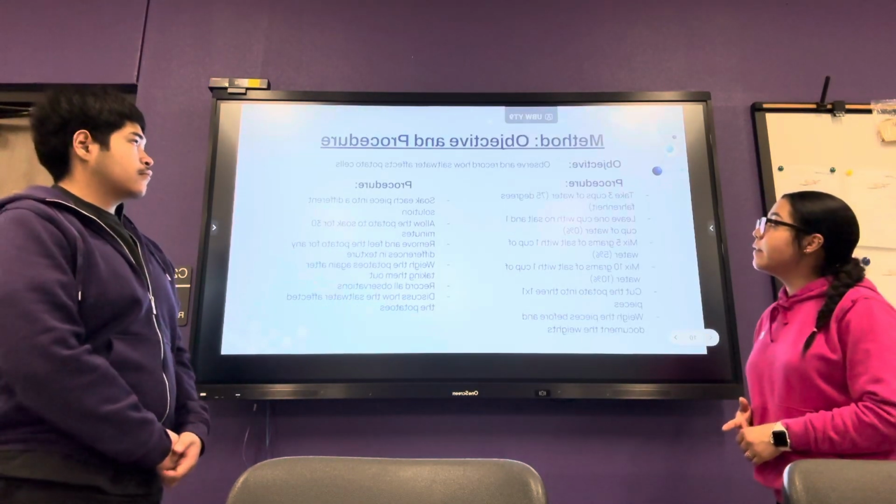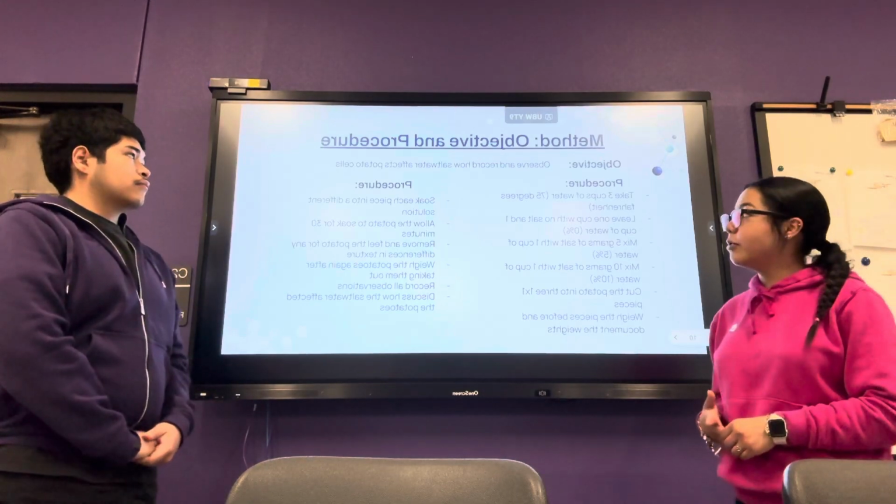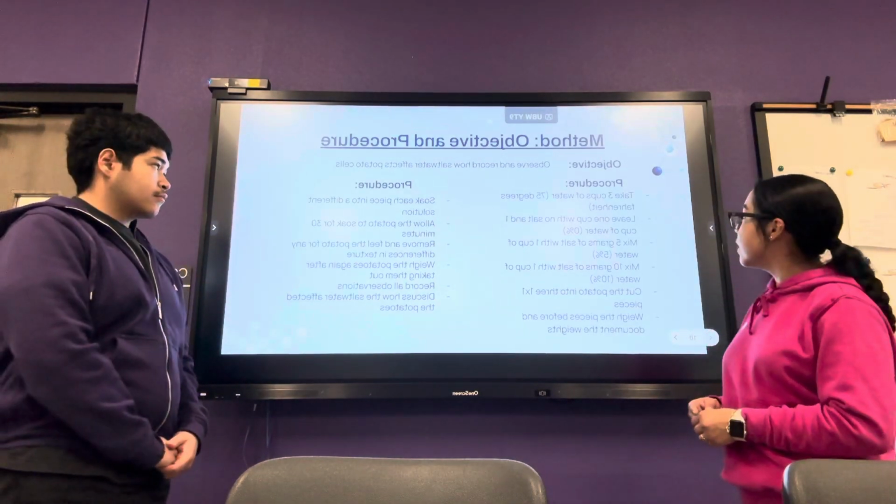Our methods, objective and procedure. The objective is to observe and record how the salt water can affect the potato cells.